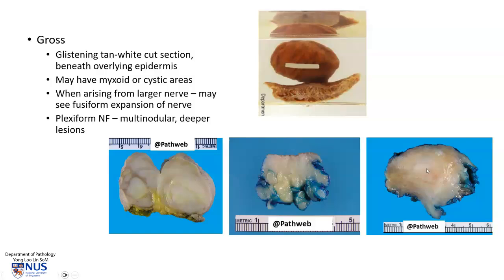Here is yet another example, and again we see this glistening appearance. There may be some myxoid areas, which kind of look translucent or cystic, especially if the lesion is larger. And when neurofibromas arise from larger nerves, they may show a fusiform expansion — kind of like a widened diameter of the nerve.